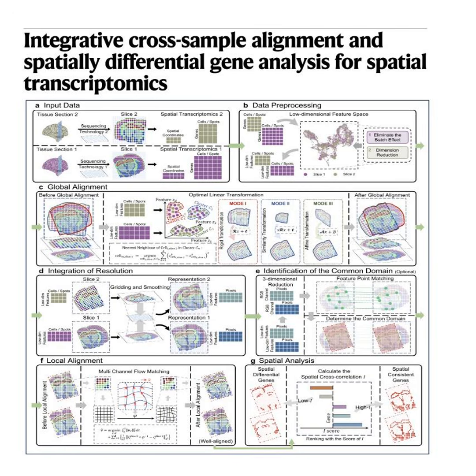Mm-hmm. But, well, we run into a massive bottleneck here. We have incredible tools to create these molecular maps, right? Technologies with names like 10x Visium, MERFISH, and Stereo-seq. We do, but the problem is that analyzing multiple tissue slices together is a logistical nightmare for researchers. Because the process of making the map actually destroys the landscape, right? You can't slice a piece of tissue that thin without damaging it. Precisely. When scientists slice tissue incredibly thin to mount it on a glass slide, it gets stretched, torn, rotated, or magnified differently during the lab processing.